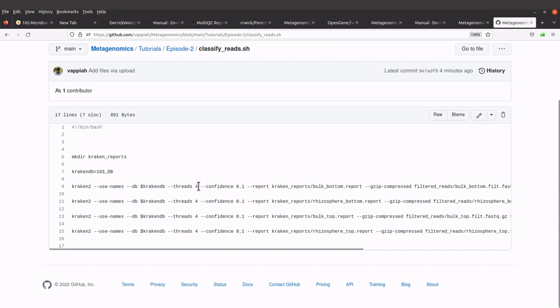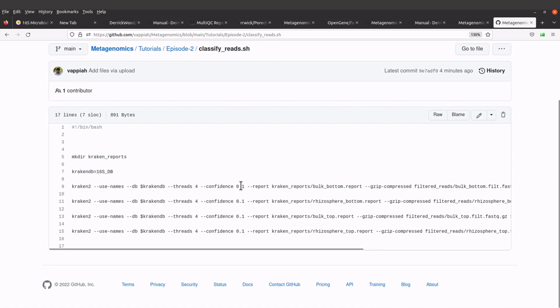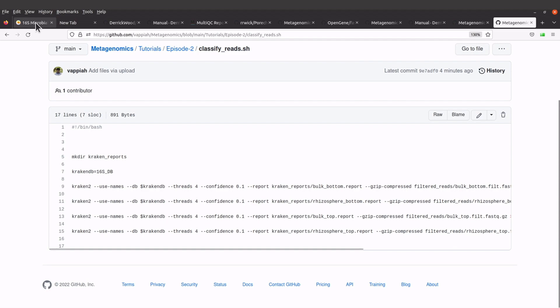We have threads, which is four—you can increase this number. There's also this option here, confidence 0.1. This one I indicated because the Kraken tutorial stated it here, confidence 0.1.